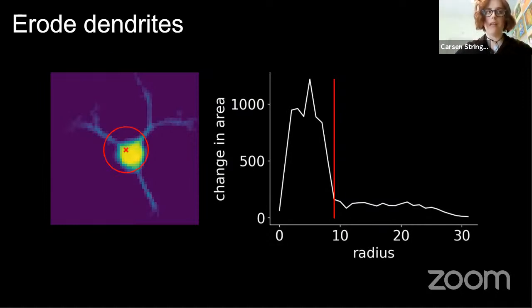We haven't been saving the neuropil pixels anymore in the output because they're really big. So that's just kind of one downside. But we could add it as an option if, as a user, you wanted to save those pixels and then ultimately find those. But if the recording is relatively dense, there won't be many pixels left in the background. If that answers your question.